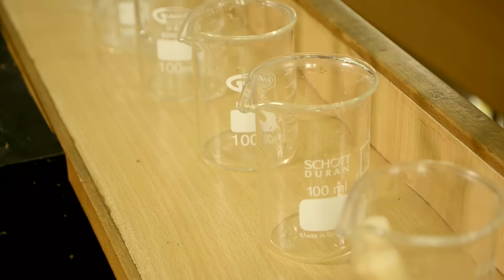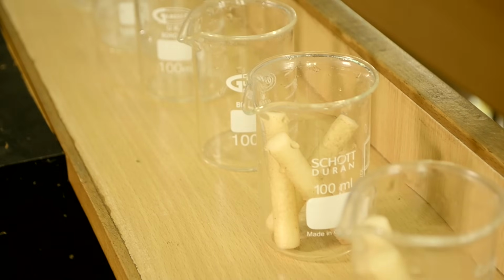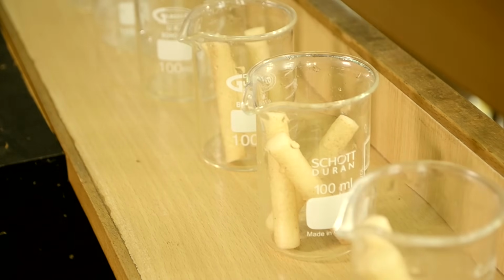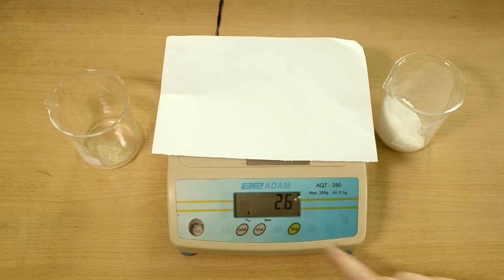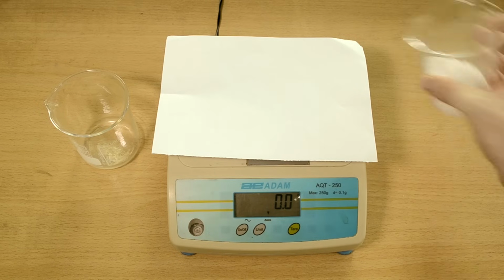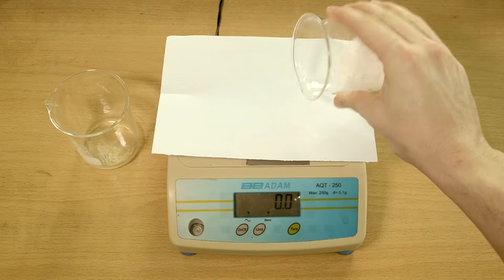Once they're ready, get 6 beakers and put 3 tubes in each. This will give you 3 repeats for each solution. The next thing to do is make your solutions. Put a sheet of paper on the balance, hit T to get the starting point to 0, and add the salt until it reads 1 gram.